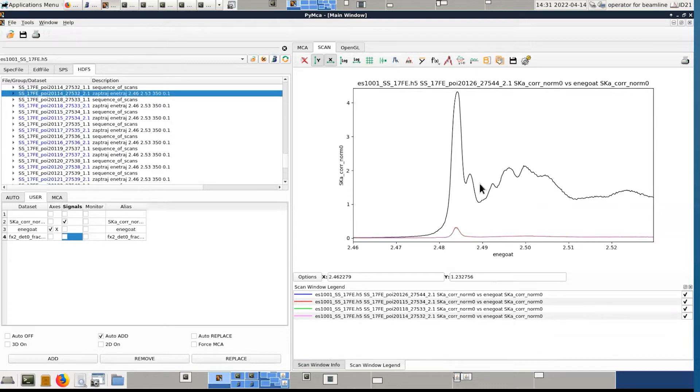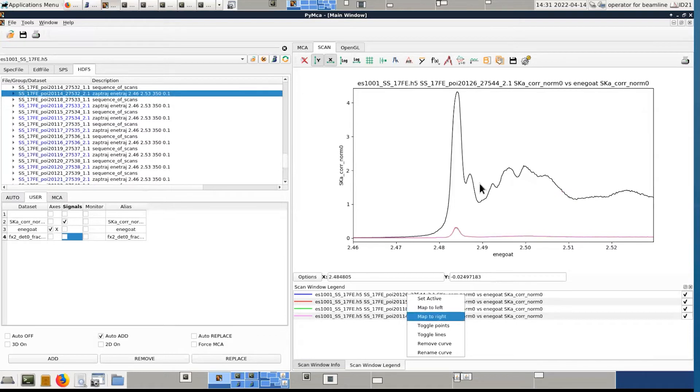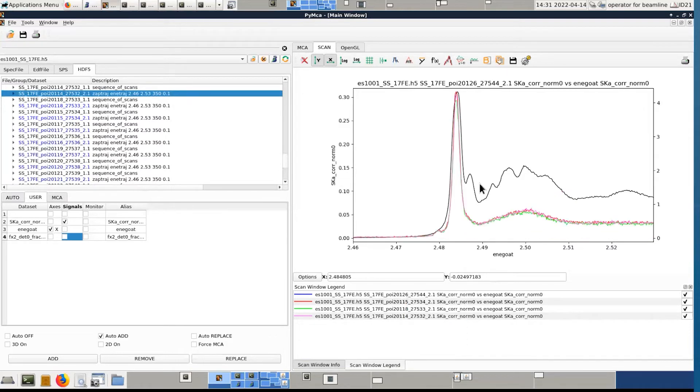You have the possibility to have the left axis and the right axis. For example, here, you see that I have a family of low intensity XANES and one which is very intense. So if I right click on the right mouse, I can say map to right. And then I have the left axis for these ones and the right axis for the black one.